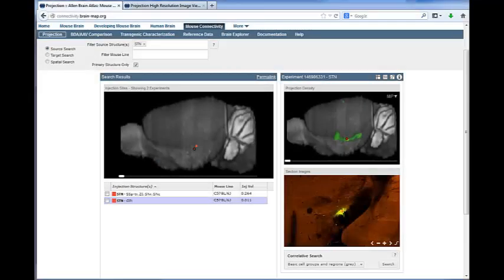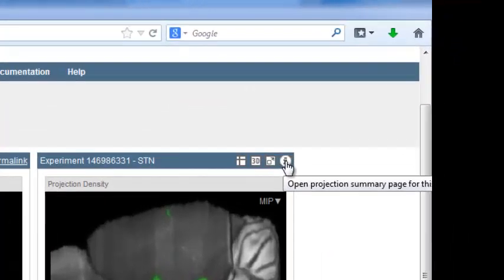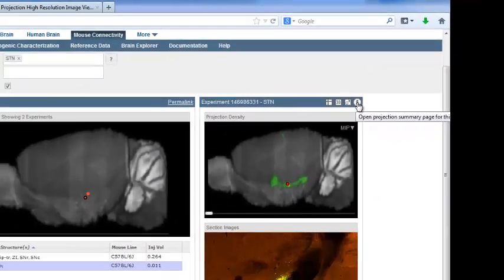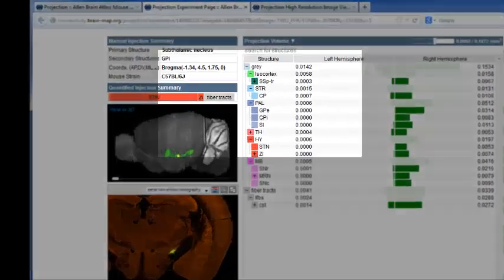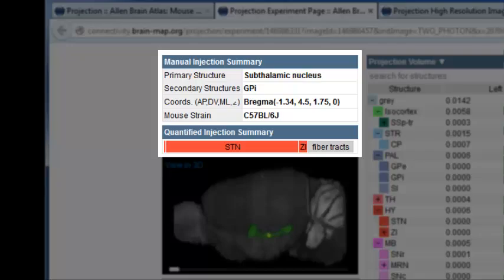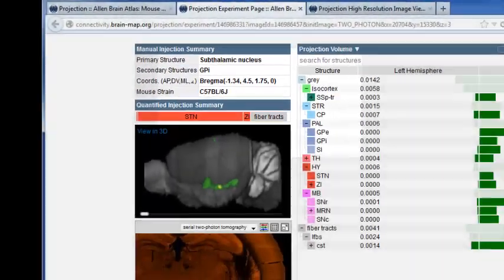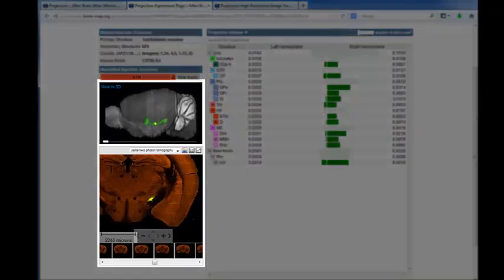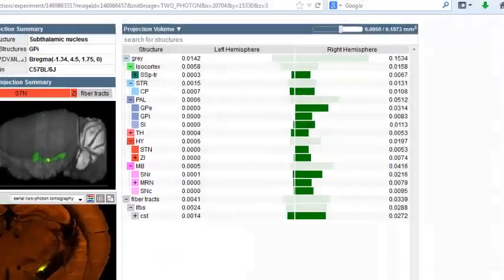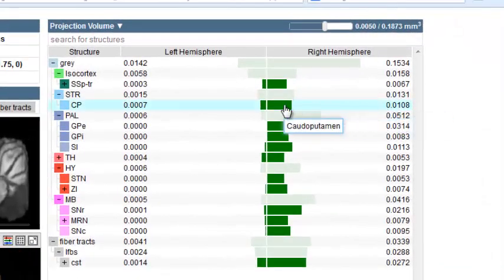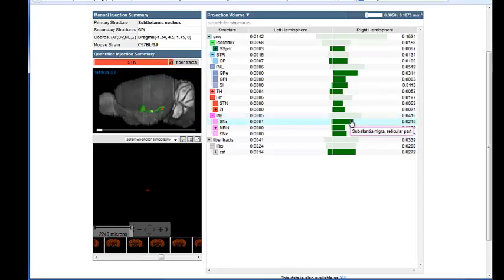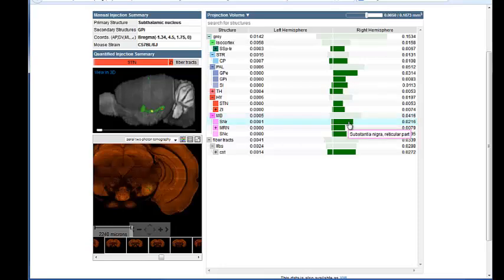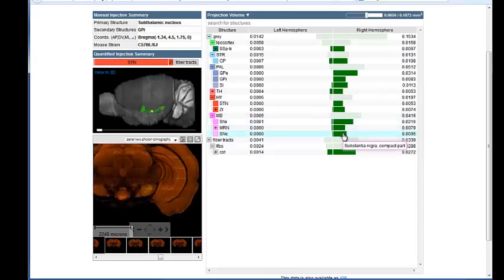Once you have found an experiment of interest, you can also see a quantitative analysis of the signal by clicking the eye icon. The experimental detail page that opens includes a manual injection summary, a quantified injection summary, two and three-dimensional views of the experiment, and a histogram that shows the amount of signal in each structure by either projection volume in millimeters cubed or by projection density. Mousing over the structure in the histogram will take you to that location in the image viewers.